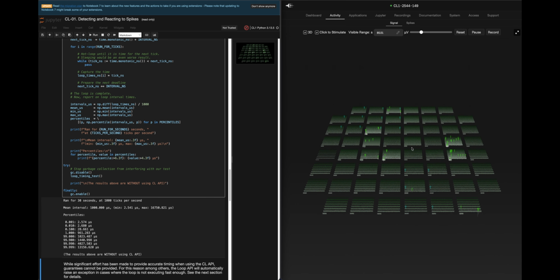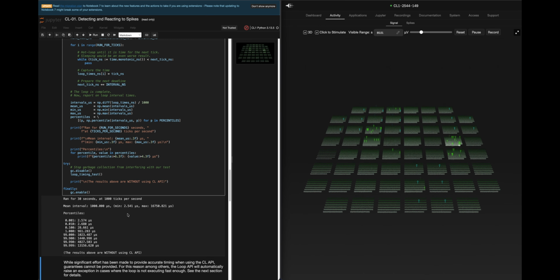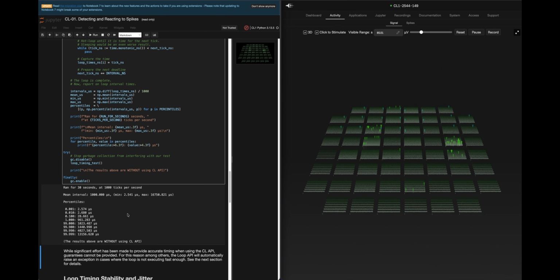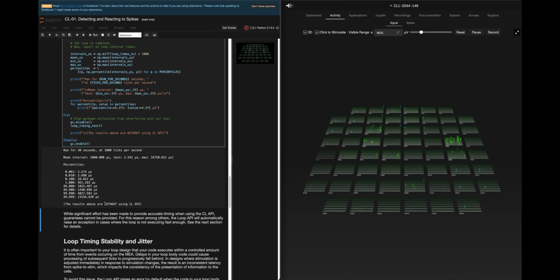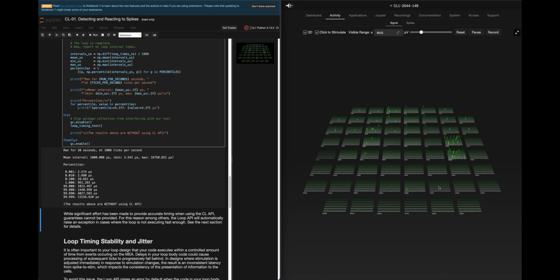This is a very, very specific system, and you have to be very, very careful with what exactly we're using. I think I have some other stuff currently running, and you can see some stimulations here happening. This is coming from a program outside that I'm currently querying the culture with, and it's very interesting.